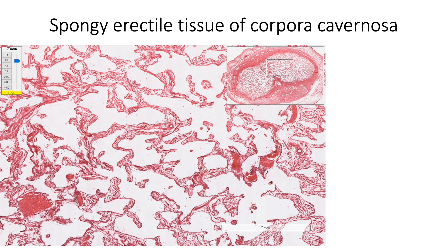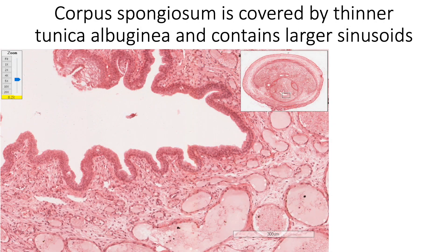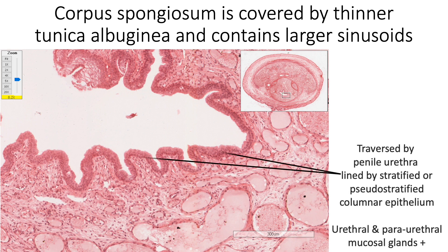Corpora cavernosa are made up of spongy erectile tissue containing smooth muscle trabeculae and large irregular sinusoidal spaces lined by endothelium. Corpus spongiosum is covered by thinner tunica albuginea and it contains larger sinusoids; it is traversed by the penile urethra, which is lined by stratified columnar epithelium or pseudostratified columnar epithelium. This lining epithelium becomes stratified squamous non-keratinized epithelium in the navicular fossa and becomes keratinized epithelium at the external meatus. A number of urethral and paraurethral glands which secrete mucosecretions are also found in the wall of penile urethra.